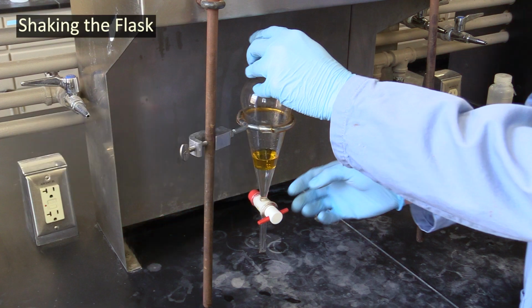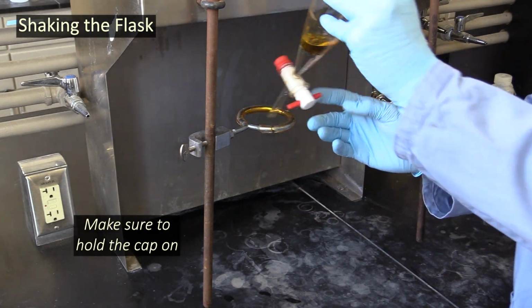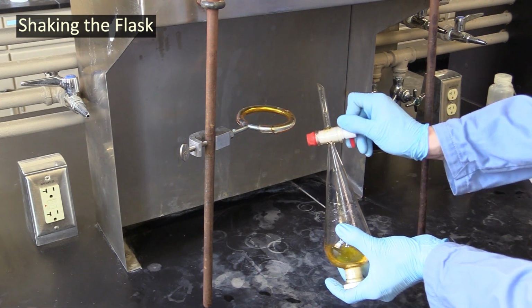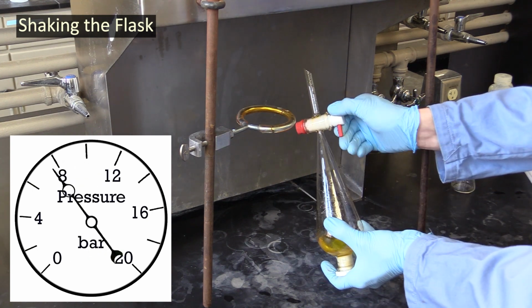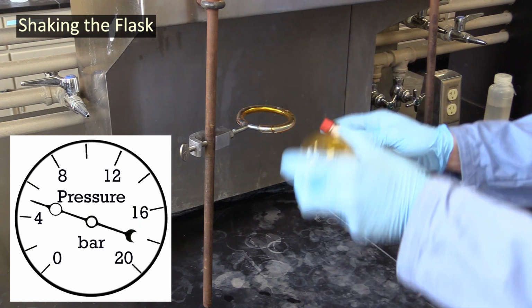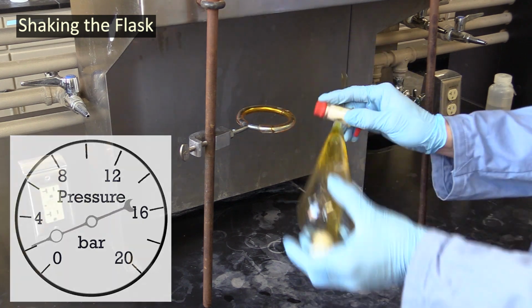To help the extraction along, you're going to have to shake your flask's contents. To start, make sure you've got your fingers on the cap to hold it on, give the flask a small shake, then point its spout into the hood and open the valve to vent it. This is to relieve the pressure that builds up during shaking. After the first time you vent it, the pressure buildups won't be as bad, so you can shake it a little longer and more vigorously before you vent it again, which you want to do every few seconds or so.